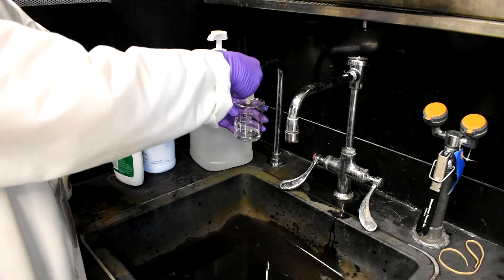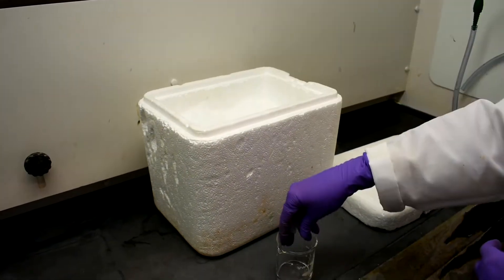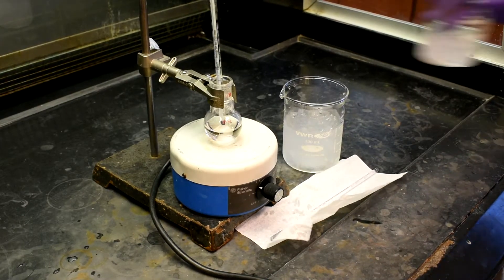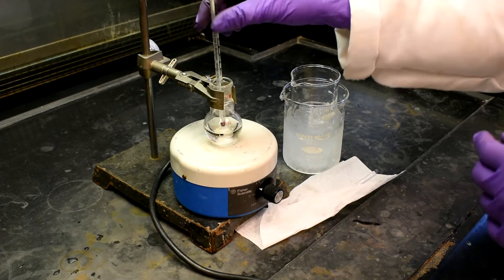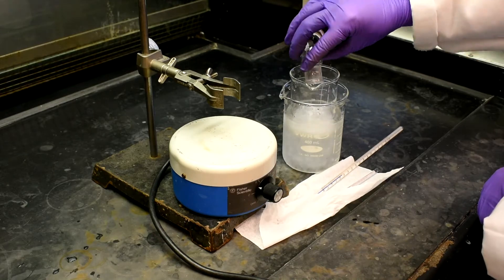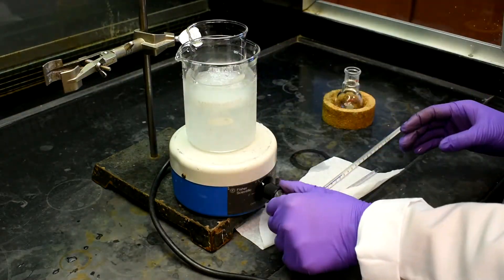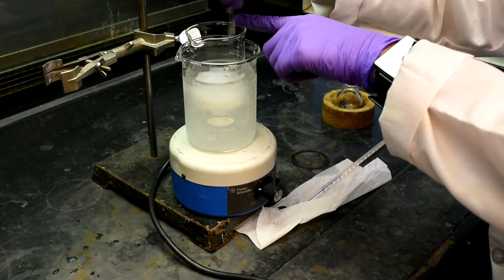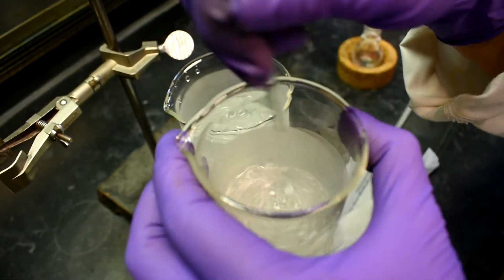Obtain about 20ml of DI water and add a few pieces of ice to this beaker. Then prepare another ice bath and place the beaker inside the ice bath. Carefully pour the nitration solution into the beaker. Stir the solution until precipitation is complete. You'll notice that the cloudiness of the solution dissipates as the product precipitates from the solution.